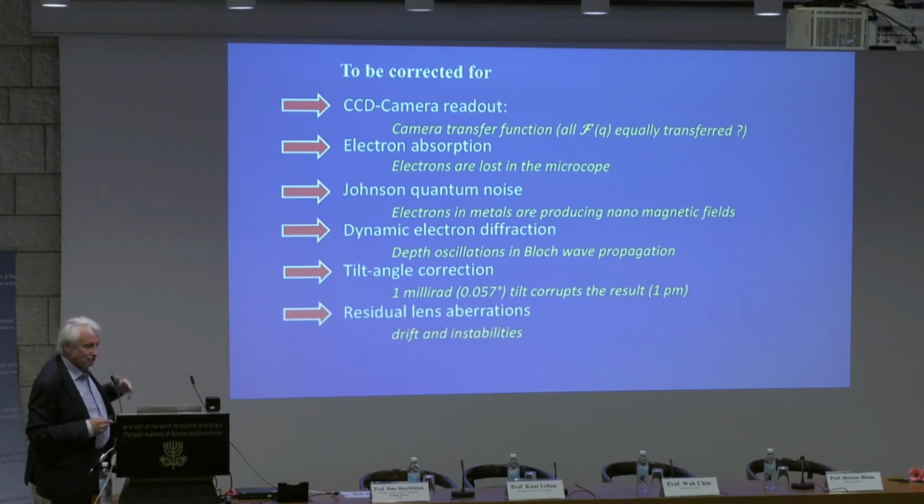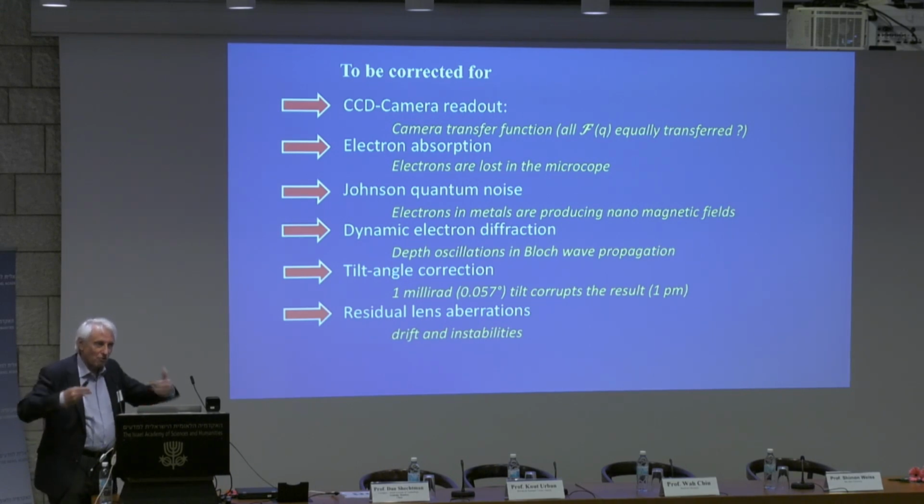And then there is something which is also normally not considered. We are at the forefront of what is technically possible today. That means you are never sure that the lens parameters which you have adjusted by current adjustment, that these parameters are still valid 1 hour after you have started your session.